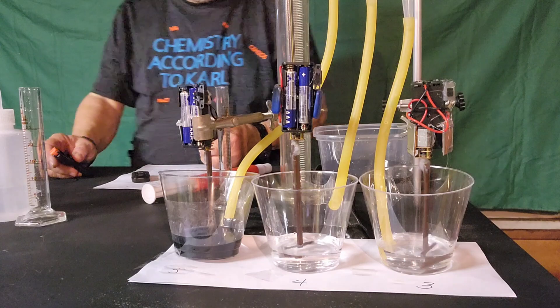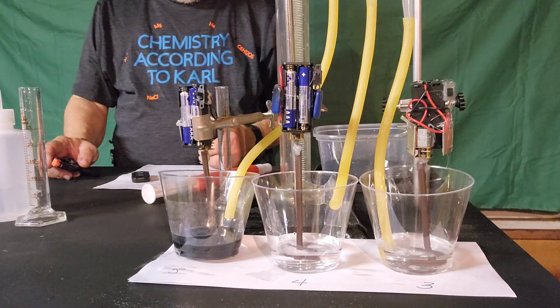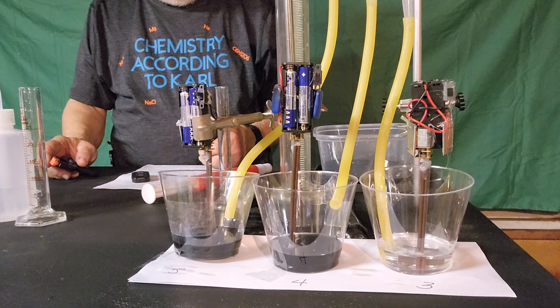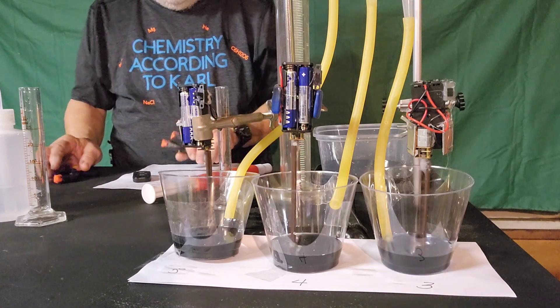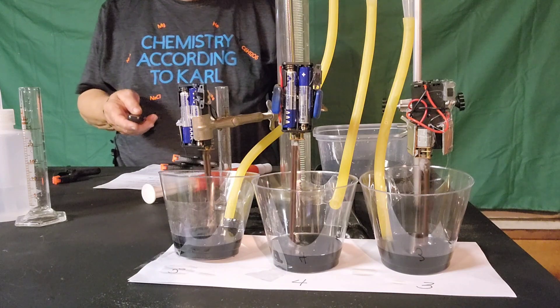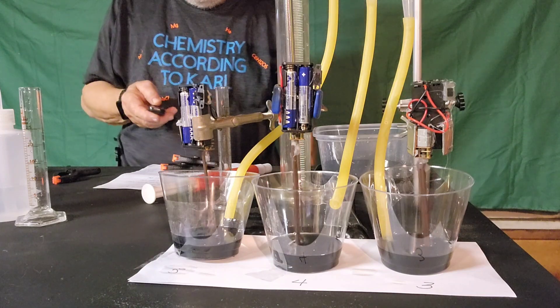So there's one — that had five milliliters of one reactant. That one had four. And that one had three. And by golly, that little trick all worked. All that worked for 30 seconds worth of joy.